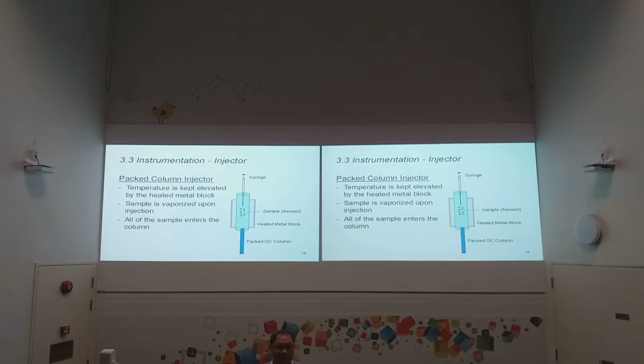For your experiment, you're going to handle the sample, do the sample treatment, and then introduce the sample using the syringe manually. It can also be done automatically: the instrument comes with an auto injector with the syringe installed inside, which takes the sample and does the injection automatically. But we would like you to do it hands-on.